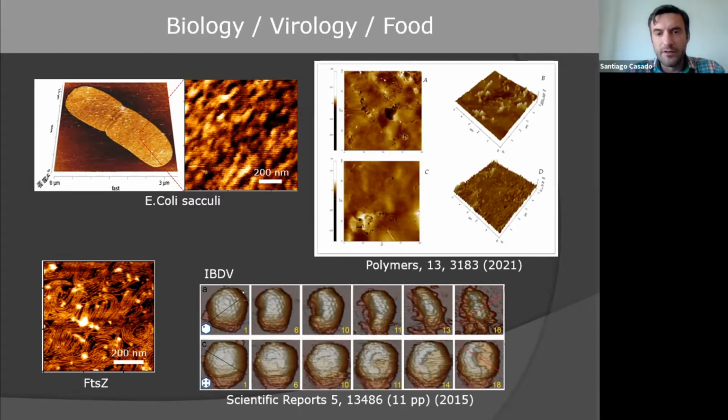So in the upper line, we press the capsid with the tip in a controlled way, and we saw that it breaks up quite easily. Once we have a hole, it breaks up. This is because inside there is not a lot of RNA. But if we increase the amount of RNA inside, you can see that with the same force, the capsid can bear much more force. It can keep its shape. So it's also helping with the scaffolding of this capsid.